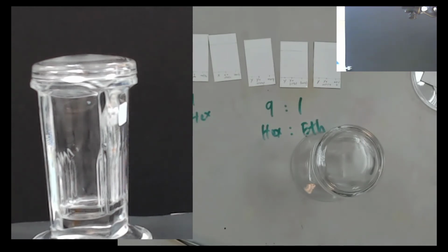Wait, I need to set it so that it's facing the. Wait for a minute. I don't know whether this will become better or not, but wait for me.